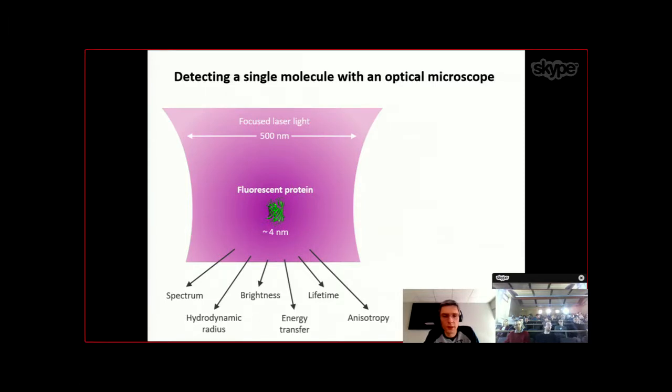But there's one item that is remaining, and at some point we even forget about it. It's the optical microscope. That didn't change so much. The microscope objective is still more or less the same, and basically it's limited by diffraction. So conceptually, you're still using a high NA microscope objective, like Ernst Abbe designed actually 150 years ago. So that didn't change that much.